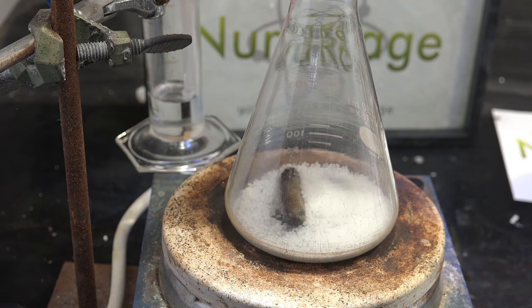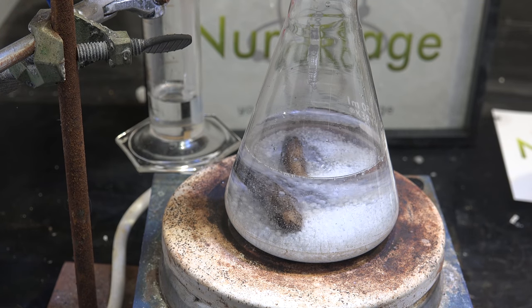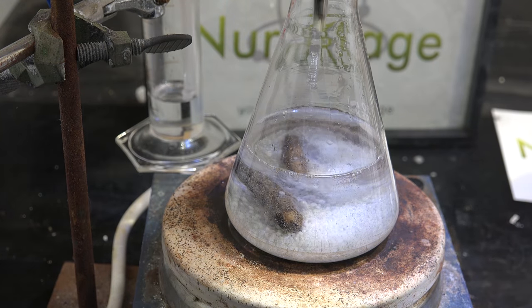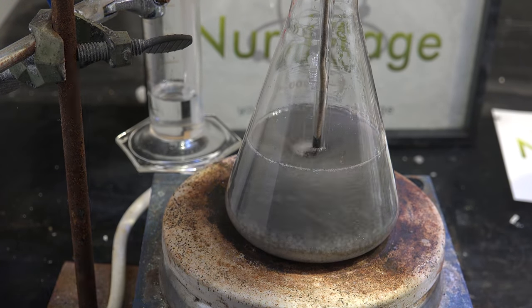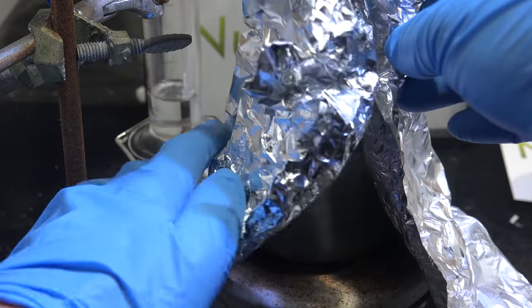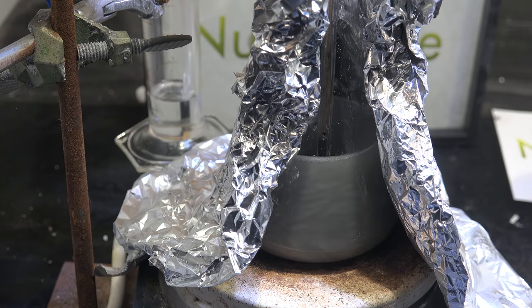So I set up another run using the same flask but this time ramp the temperature to 200 celsius over the course of 8 hours. This time I didn't put in magnesium since we already know we can make sodium even with aluminum present. So to save time I'm just going to focus on the aluminum drying.